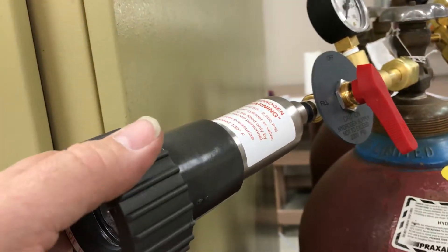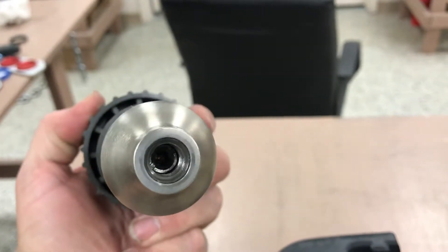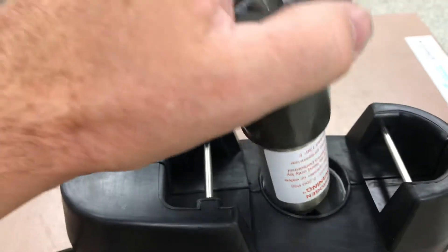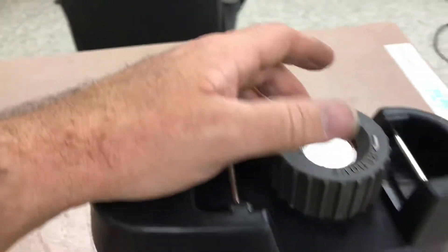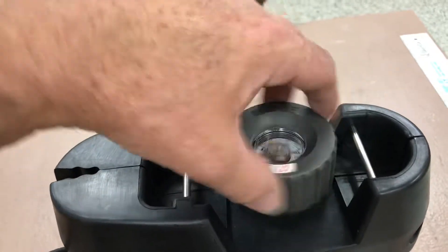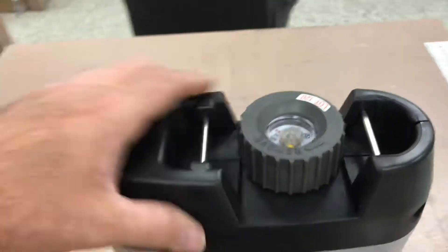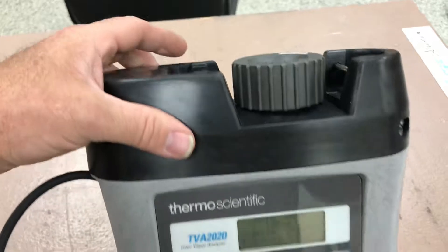Once it's full, simply remove it — it's usually on tighter, I just had it there for quick access. Bring it over and you can see the assembly fits down into the TVA 2020. It's hydrogen, so it's a reverse thread, meaning you turn it counterclockwise to tighten it. It takes quite a few turns.